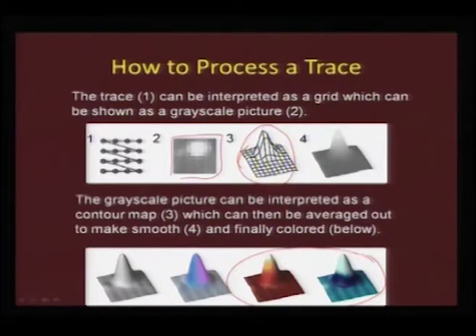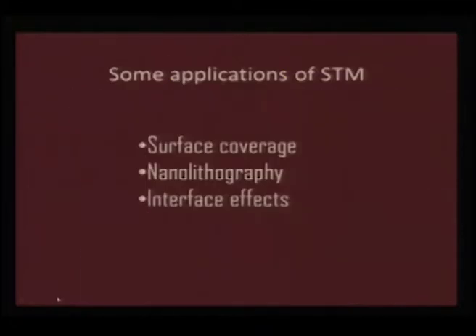So, once you scan through, there is a procedure by which we can map the imaging. Therefore, this comes out as software. We will not be looking at those details. Each of these scans is processed with a software procedure which will give you the pictures the way you desire. There are also some calculations that can be made on every STM topography that you make.